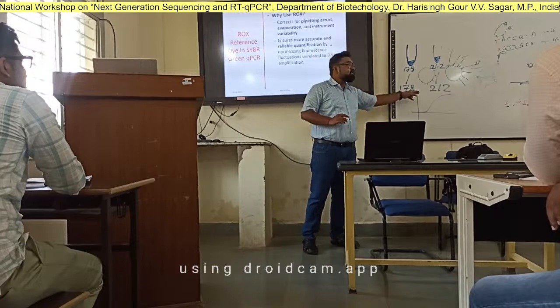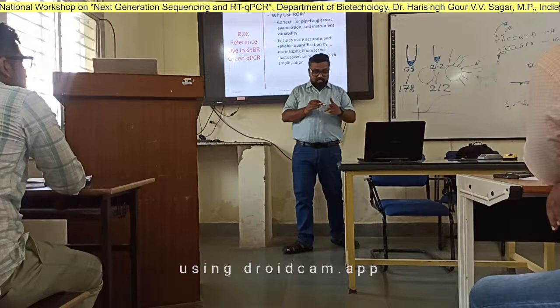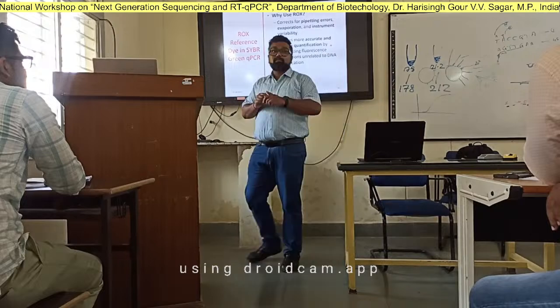Students might be interested to know whether there is a need to use housekeeping genes right now. No, no. We'll complete that. We have not entered that yet. We are still in the technique.